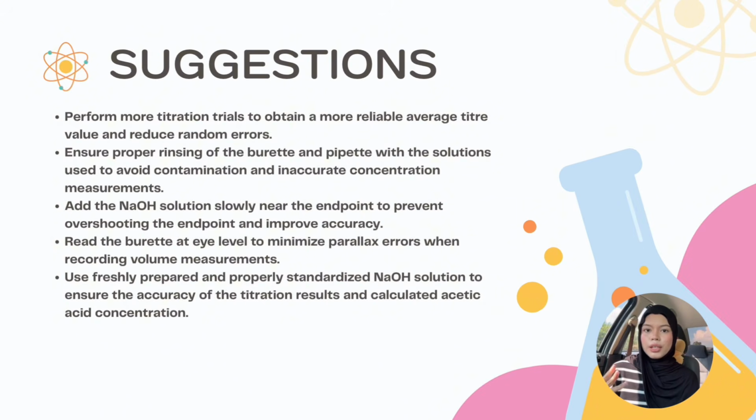Fourth, the burette reading should always be taken at eye level to minimize parallax errors and ensure accurate volume measurements. And finally, using a freshly prepared and properly standardized sodium hydroxide solution helps maintain the accuracy of the titration and the calculated concentration of the analyte.